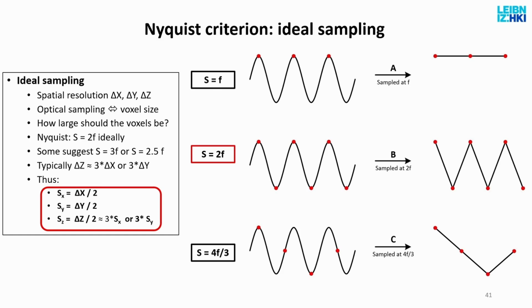The reason for that is quite simple: if you have a periodic signal and you sample it at exactly the frequency of the signal, then there is a very good chance that you always pick the peak, or you always pick halfway through, or always pick the bottom. So you will not see the pattern.